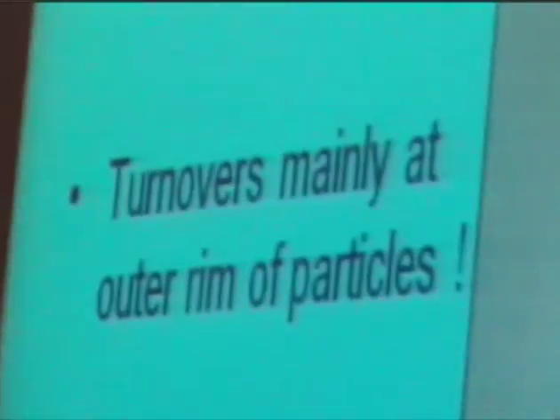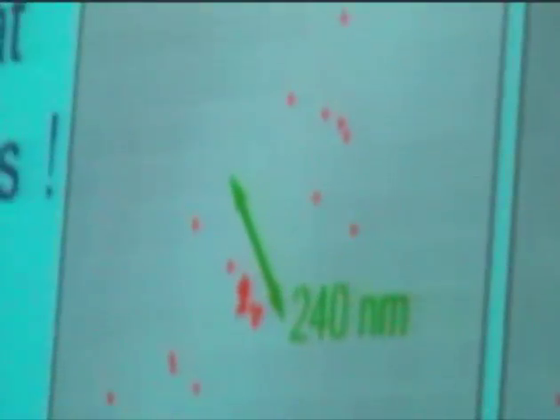Now, if you look at the results, so here I plotted, in gray you see vaguely the contours of the titanium MCM41 particles. And on top of that, I plotted in red the fitted positions of all the flashes of light that we could see in an experiment during about 150 seconds. So every red dot is the accurately determined position of an individual turnover event, thus of an individual active site.